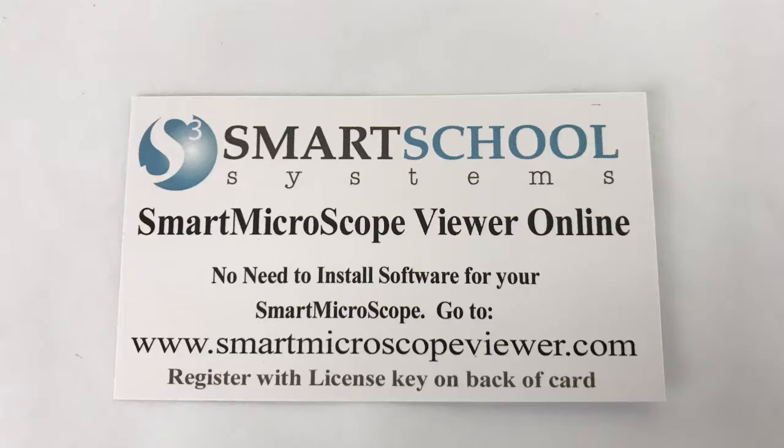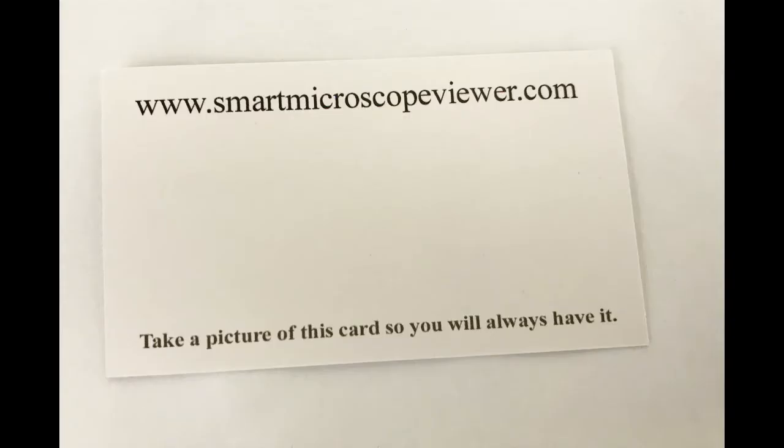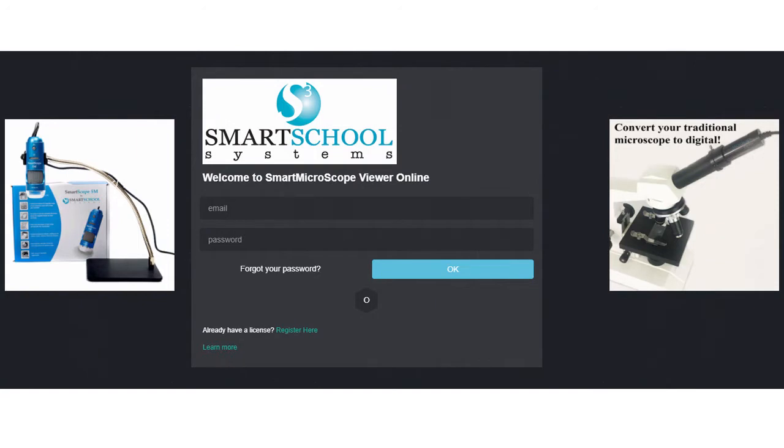So get the card out, because we're going to turn that card over, and on the back you will find either a username and password, or you will find a license key. So we're going to go to the website, SmartMicroScopeViewer.com, and you will either enter the username and password, or if you have a license key, you'll click the register here.